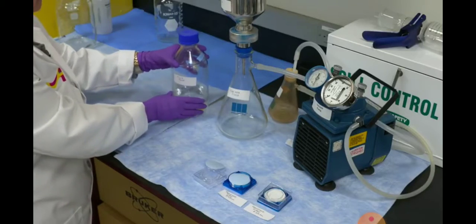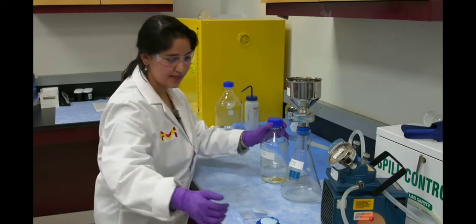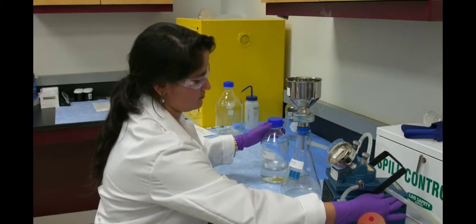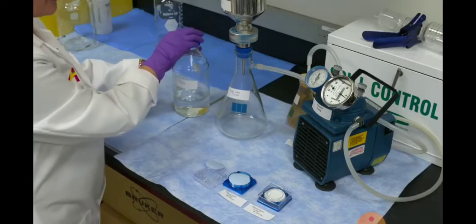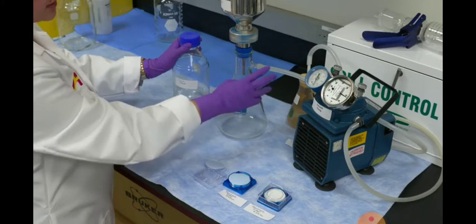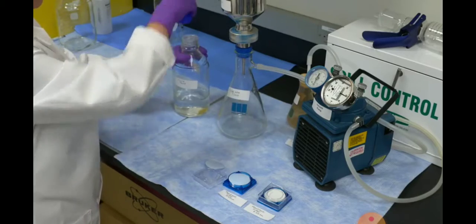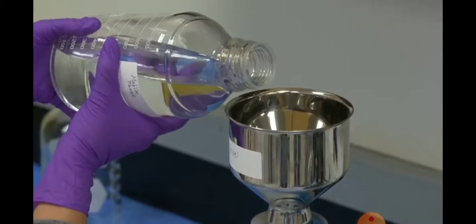Then you will have your mobile phase on the side, ready to be poured. The next step is you turn on the vacuum pump, and make sure there are no bubbles in the tubing. Then you slowly pour your mobile phase in the funnel.